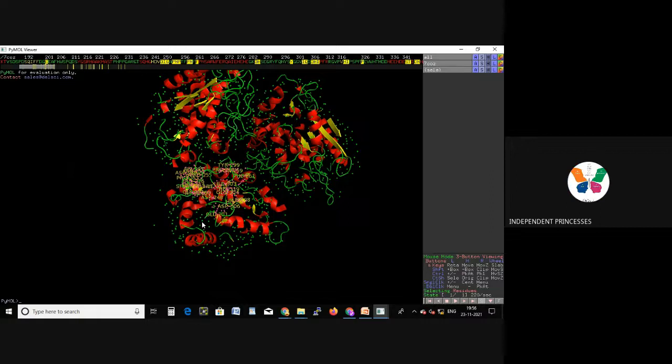Pocket chain is not for global, it is for local docking. It is used in AutoDock and PyRx also. In case of global docking, the entire protein will be selected, and then we are not going to look for the residues. When we concentrate only on a particular region of those residues, we call it local docking. Score matching will be done, depending on the number of repetitions we do.